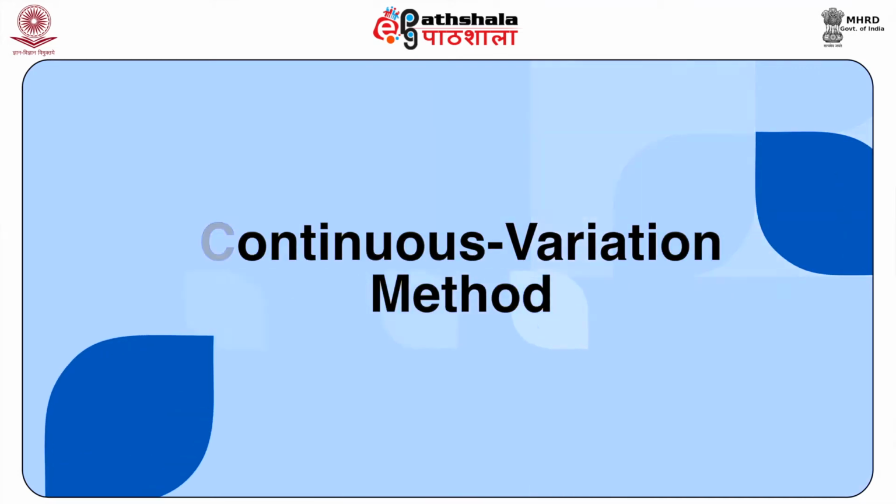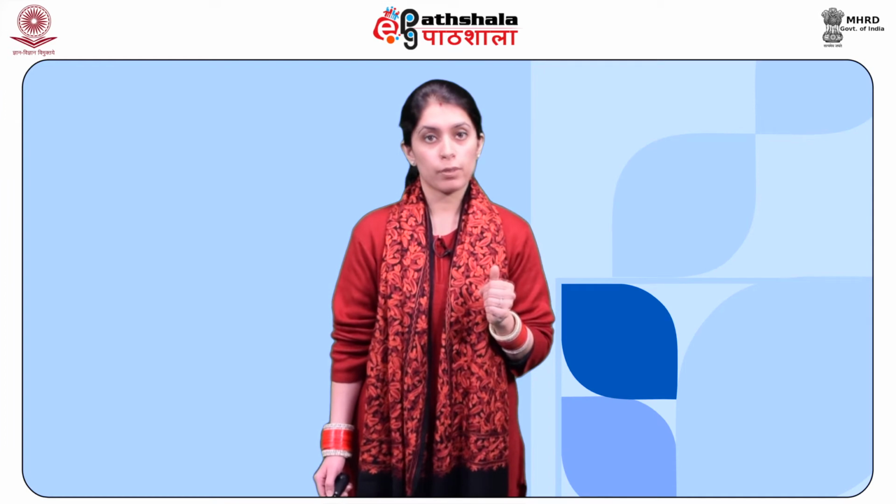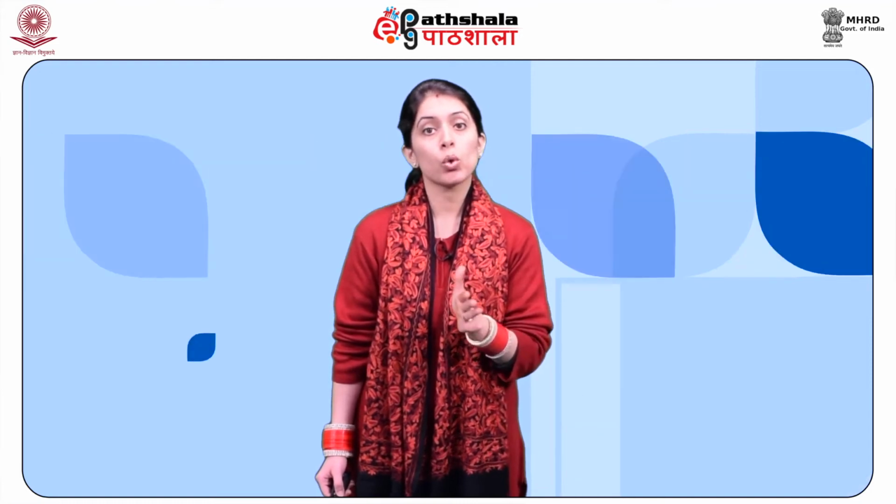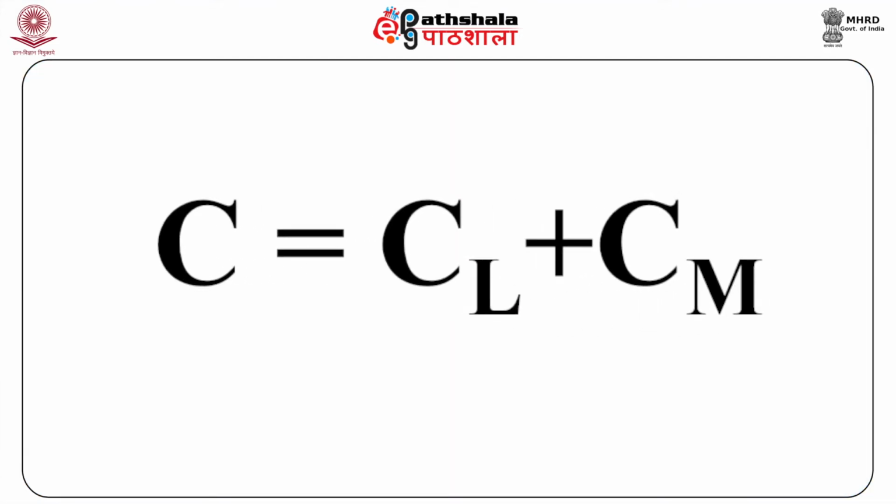Now, let us begin with the continuous variation method. Let us try and understand what this method is all about and how we can use it to determine the stoichiometry or composition of the complex under consideration. Job's method is also known as the method of continuous variation. The principle of this method is that the mole ratio of the metal ion and the ligand is varied between 0 and 1 at constant total concentration, that is total concentration C is equal to C_L plus C_M, where L refers to ligand and M refers to metal ion, and the absorbance of the solutions of different composition is measured. The absorbance is then plotted against the mole fraction of the ligand, that is chi L.